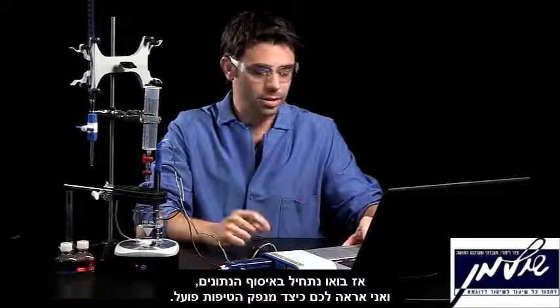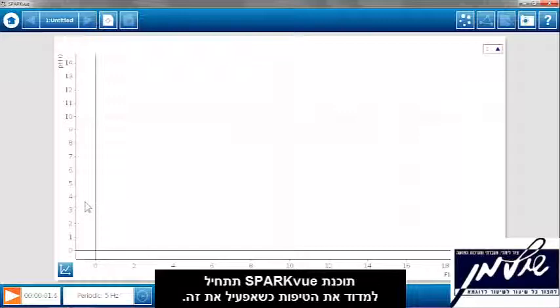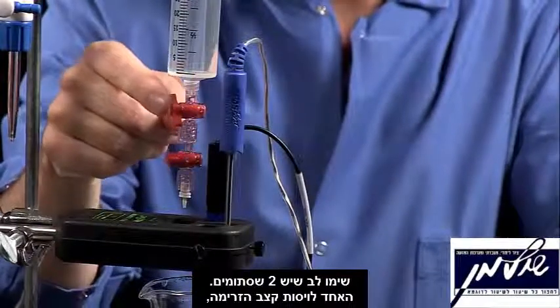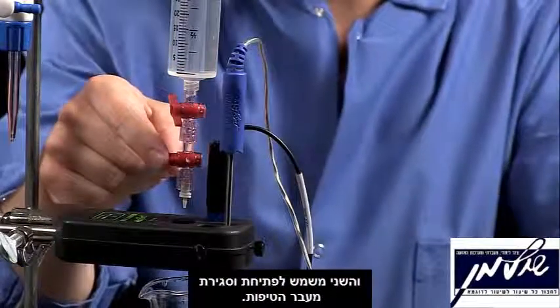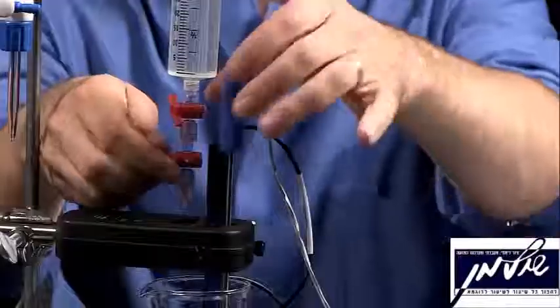Let's start the data collection, and I'll show you how the drop dispenser works. It's going to record a drop in SparkView when I turn this on. Notice the two stop cocks — one is for setting the flow rate, and the other one is for turning it on and off. There's a little tip at the end to ensure a very small drop size. So I'm going to turn this on.